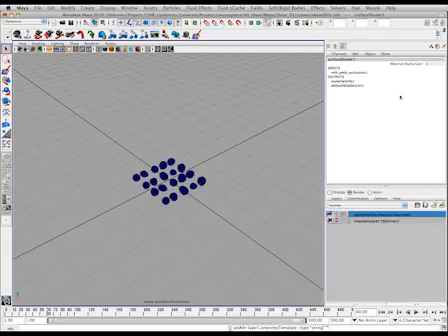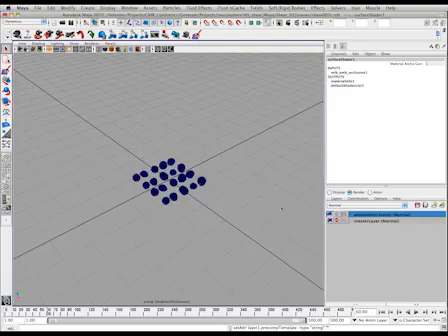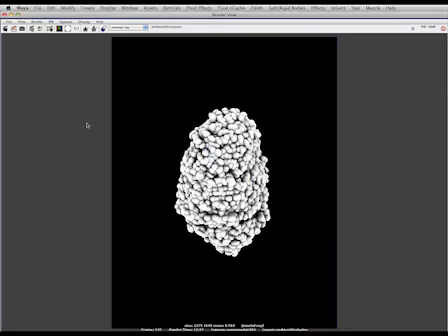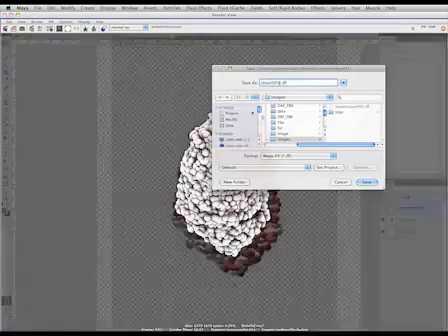Reopen the Channel Box Layer Editor and under the Options tab, open the Render All Layers options box. Select Composite and keep layers. With the ambient occlusion layer selected, change it from normal to multiply from the drop-down box just above the layer list. Render 2 passes of the neurosphere, once with the ambient occlusion layer turned on and once with the master layer turned on. Save the images as IFF files in the Projects Images folder.